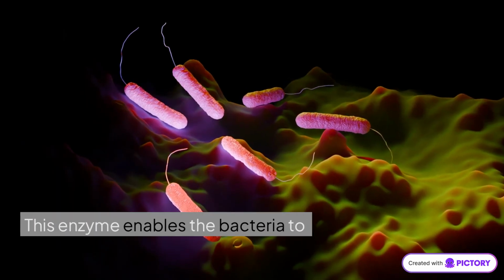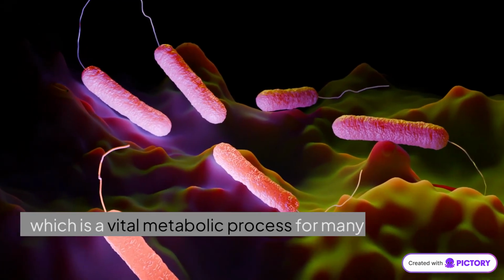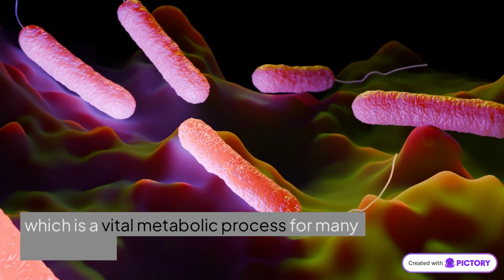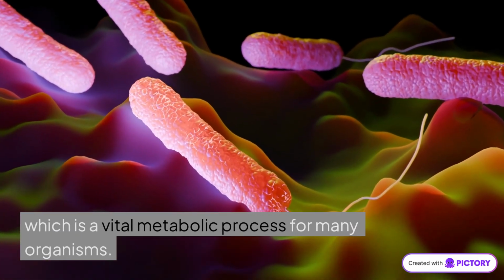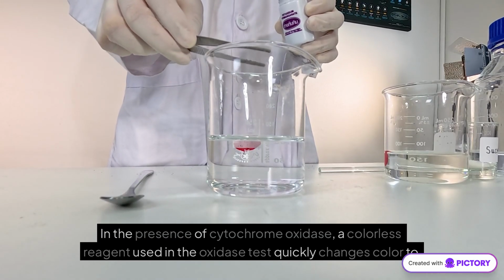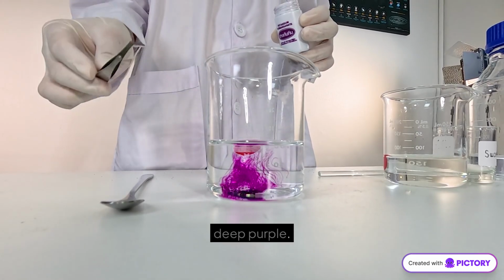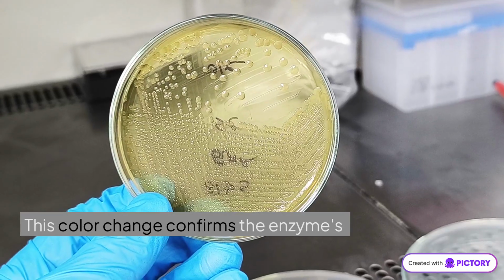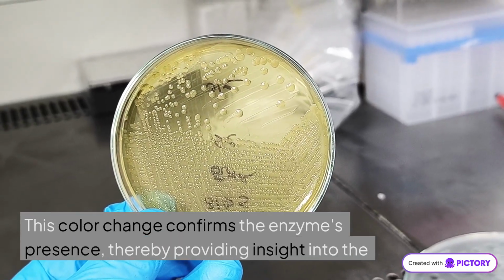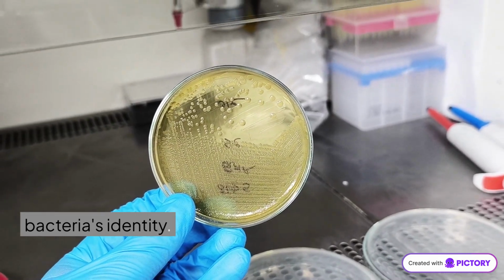This enzyme enables the bacteria to effectively utilize oxygen during respiration, which is a vital metabolic process for many organisms. In the presence of cytochrome oxidase, a colorless reagent used in the oxidase test quickly changes color to deep purple. This color change confirms the enzyme's presence, thereby providing insight into the bacteria's identity.